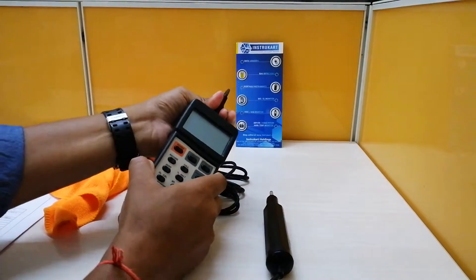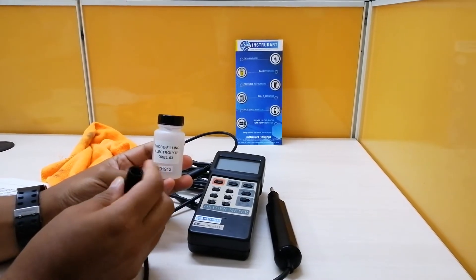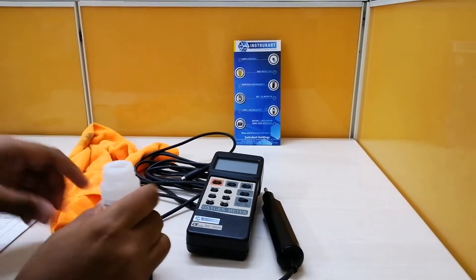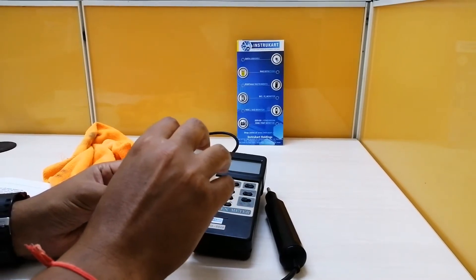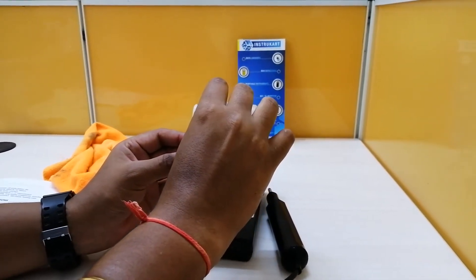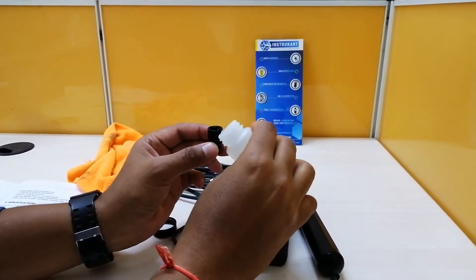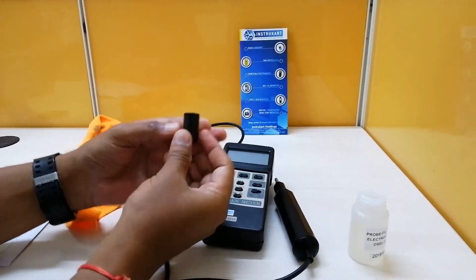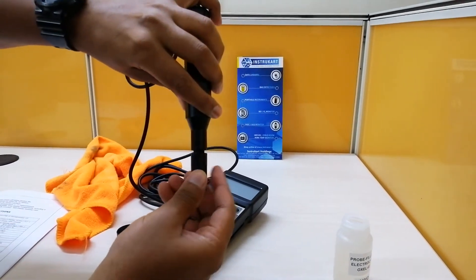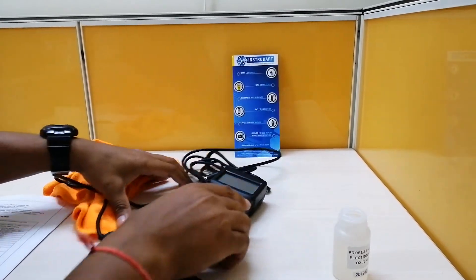I'll also disconnect the probe. The next step is to fill the electrolyte which is required for checking oxygen in air. I'm taking the electrolyte and filling it into the cap.